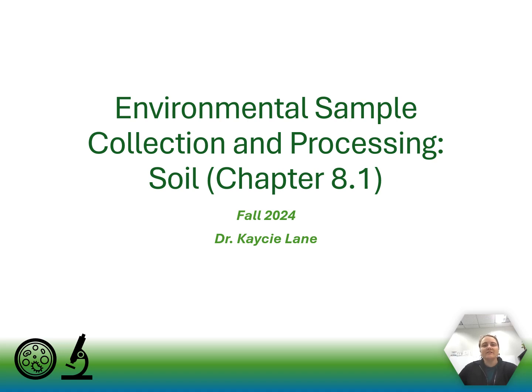All right, our last lecture in the set for this week is going to look at environmental sample processing, and we're specifically going to look at soil. So this is chapter 8.1 in your textbook, and the next couple labs that we have are soil labs. We're going to talk a little bit about how samples get collected and a little bit about how they get processed.